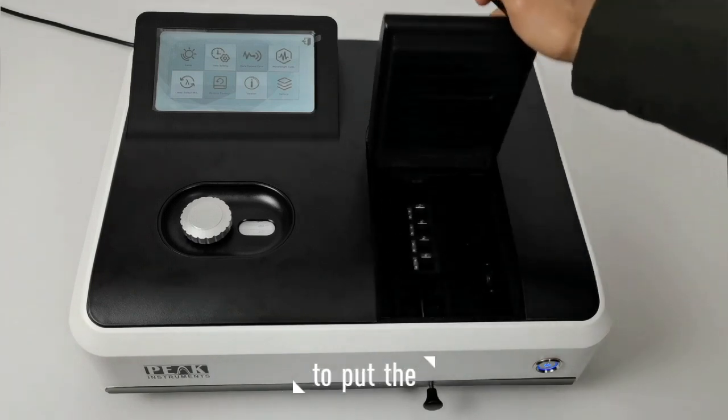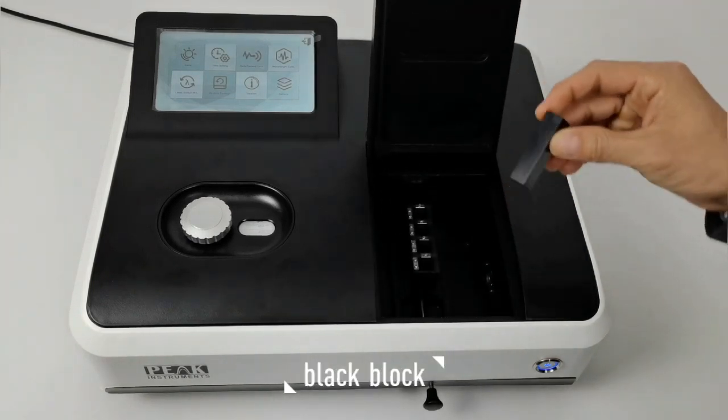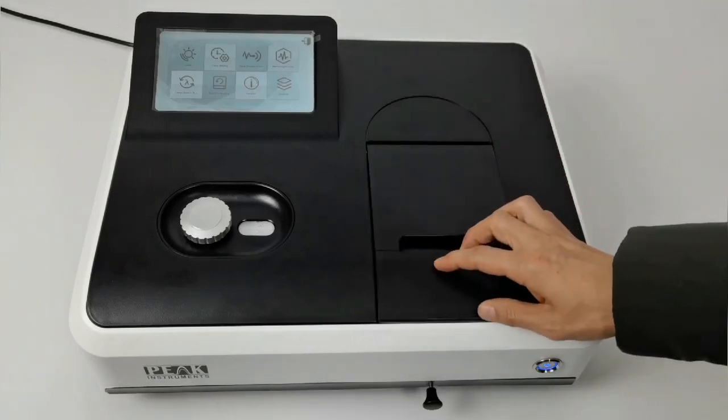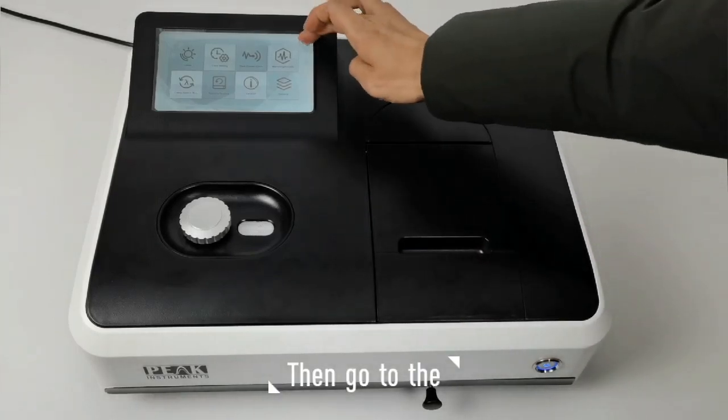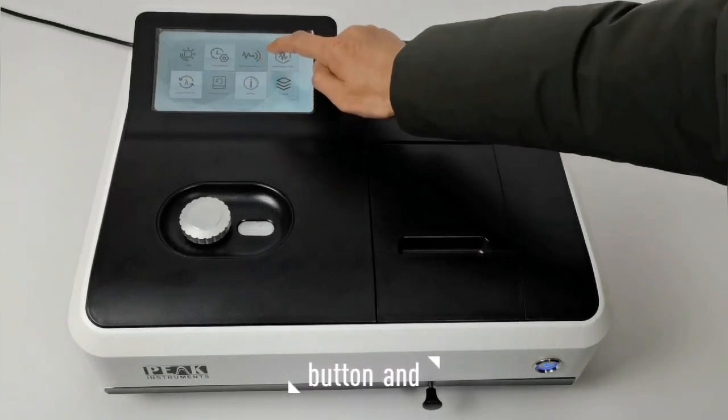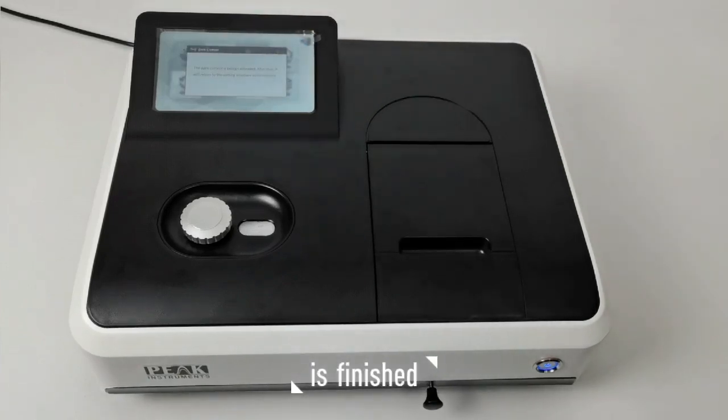First, you need to put the black block inside the cell holder and remember its position. Then go to the system and press the dark current calibration button and wait until it's finished.